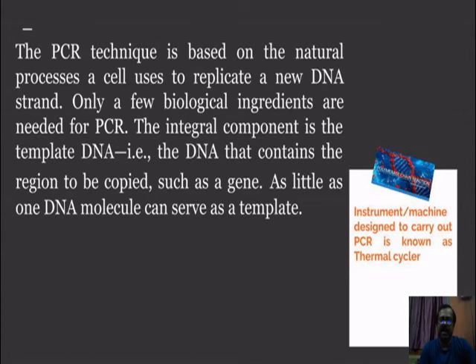DNA synthesis cannot be initiated by DNA polymerase without a primer. So for DNA synthesis, a primer is needed. The primer is a short stretch of DNA that is synthesized based on the information of the known sequence on the flanking region of the DNA of interest, that is the DNA or gene which we are going to amplify.